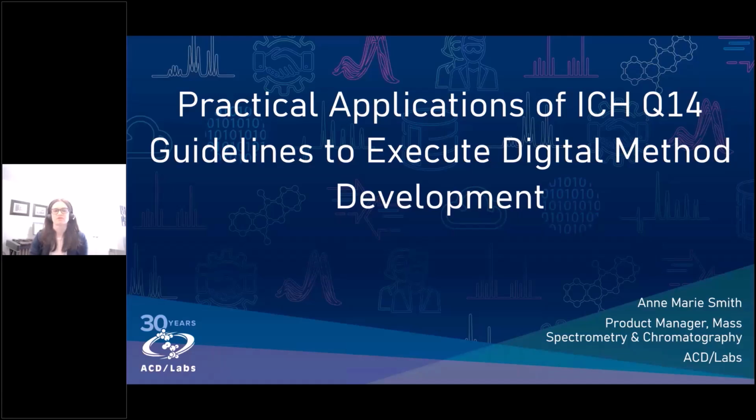So today we're here to talk about practical applications of ICH Q14 guidelines to execute digital method development. I'm just going to turn the camera off so that you guys can see the full screen.